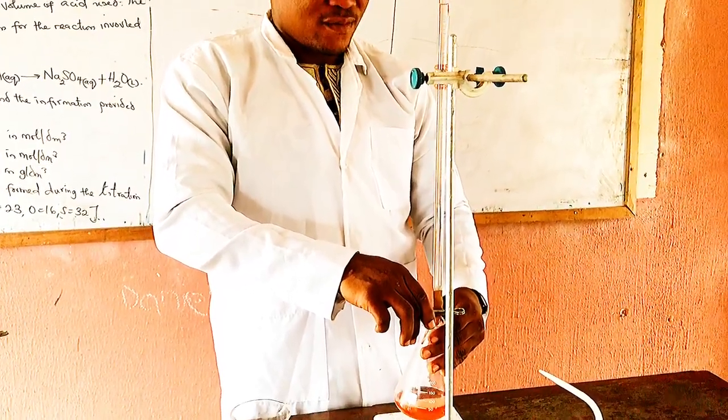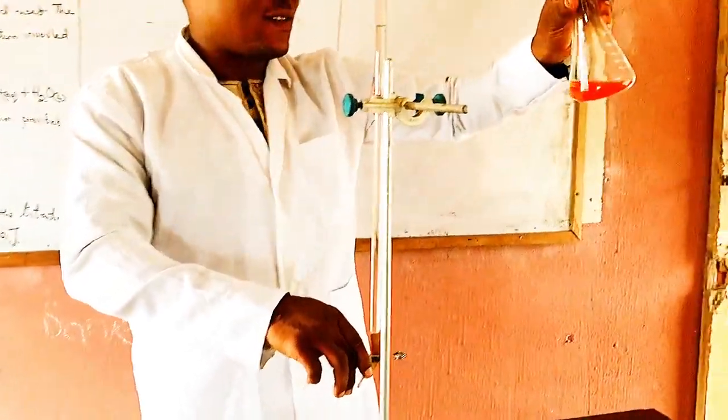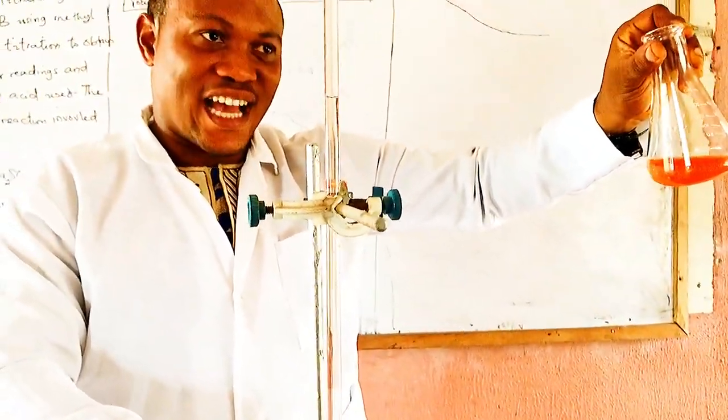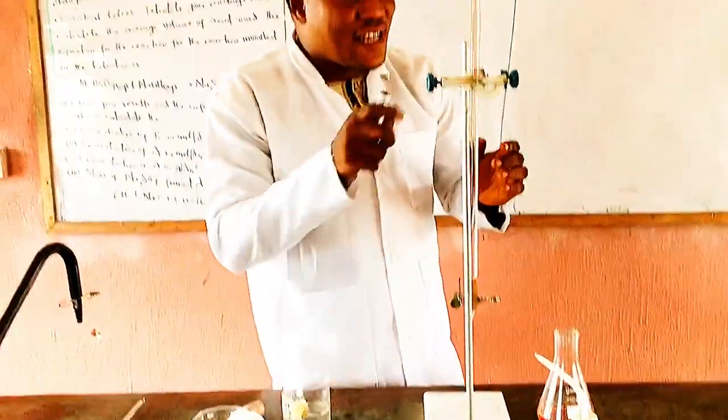If you look at the color now, it's not yellow again, it has changed, meaning neutralization has taken place. Then I'll take my readings.